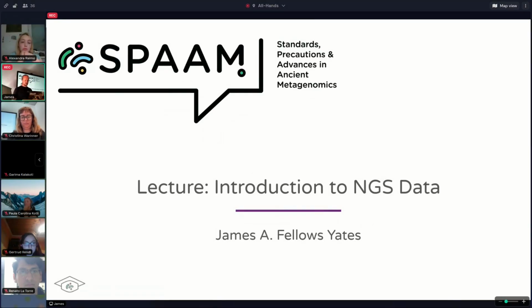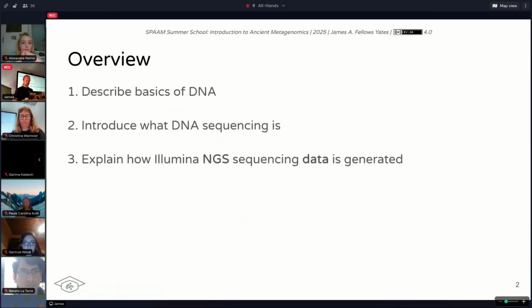So, introduction to NGS sequencing. In this lecture, we're going to go right back to the very beginning to describe what DNA is, why the structure of DNA is important for the way that DNA sequencing works, and also explain how specifically Illumina next generation sequencing, although that's sort of an outdated term now, how this data is generated.